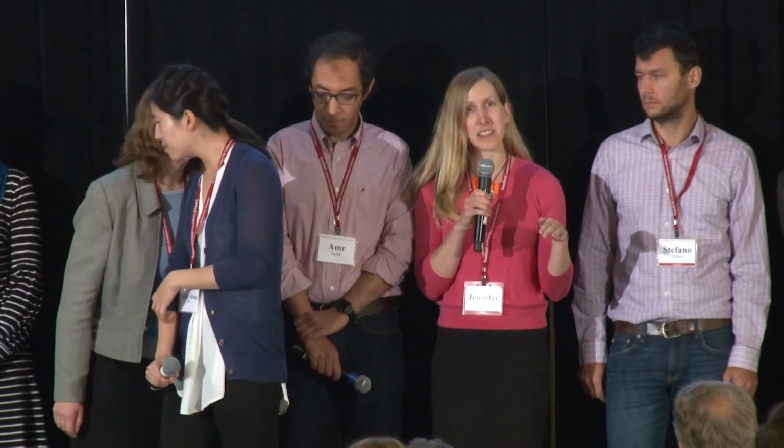I'll also just add to that, with our microdroplet platform, we have the ability to add in different antibiotic additives and see exactly how single cells are responding to those treatments. So we have a new student who just joined our team, who I think is here, Loza. Can you wave hi? Yep. So she'll be working with Sindy Tang to use our microfluidic platform, introduce antibiotics, and see how at the cellular level the cells are responding.